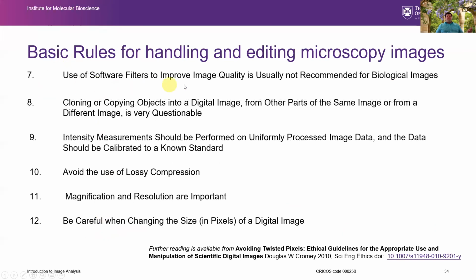Using software filters to improve image quality is not recommended, so that means not Photoshop. Cloning or copying objects into a digital image from one part of another image into the same image is very questionable. It's the polite way of saying, do not do that.